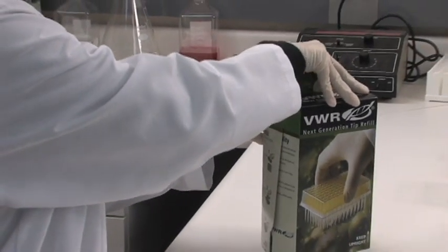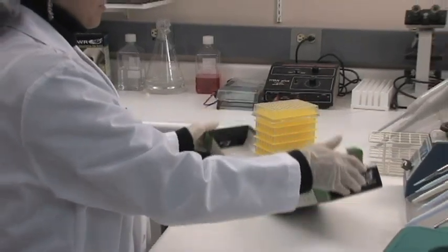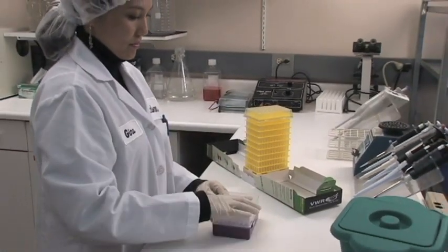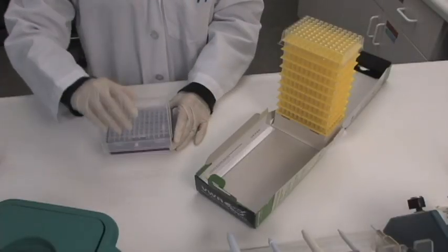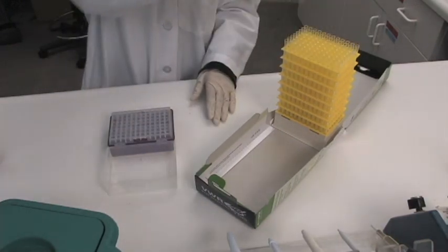The next generation pipette tip refill system from VWR goes far beyond other reload systems to bring you a complete refilling solution that helps you reduce waste.